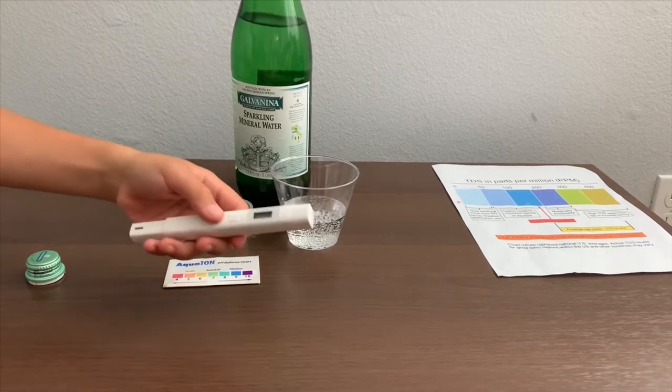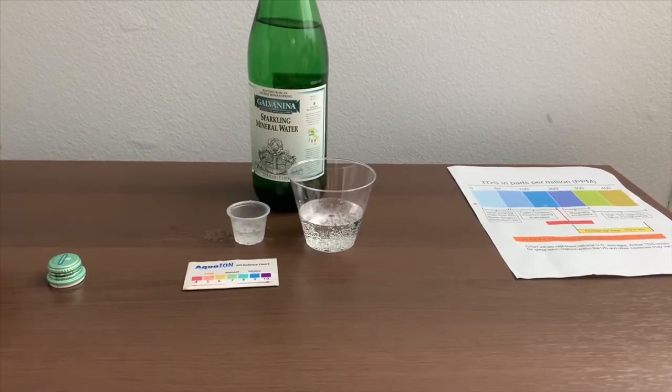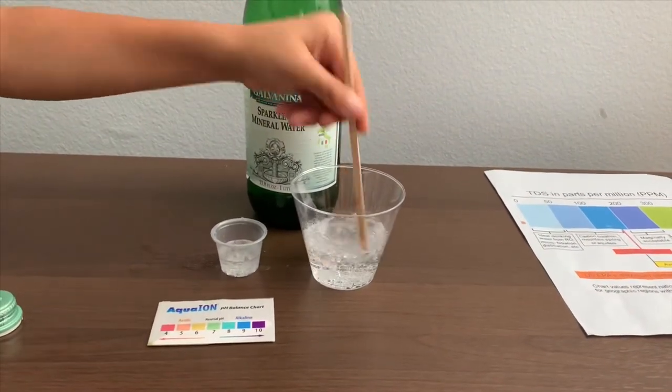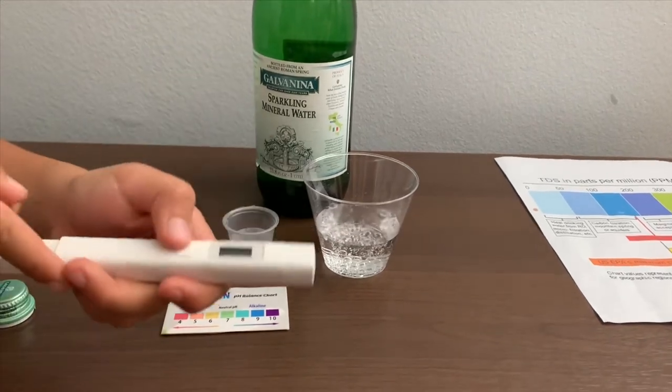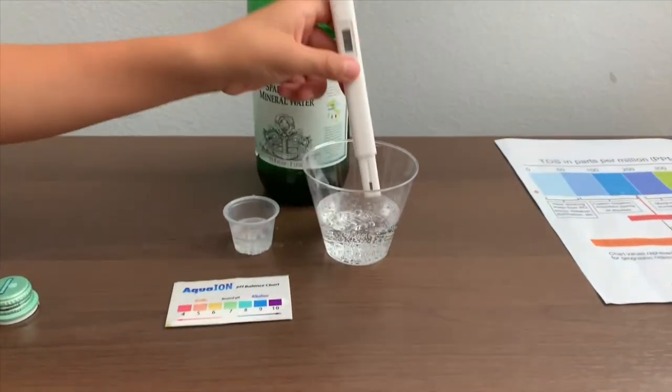If you want to buy this TDS tester, check the link down below. Let's stir it a little so we'll get a better result. Turn on the TDS tester, make sure it says zero, and put it in.